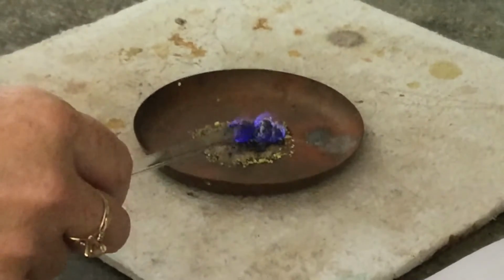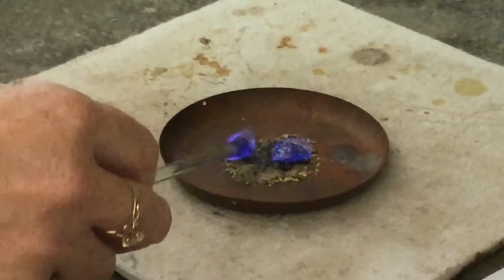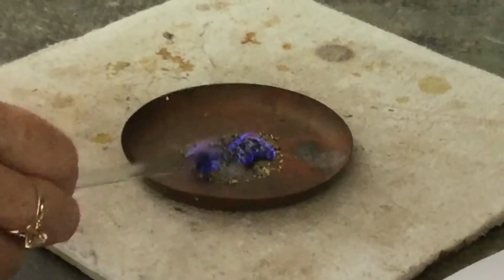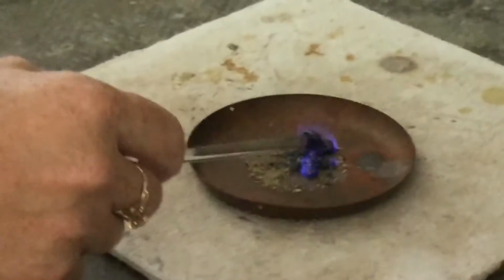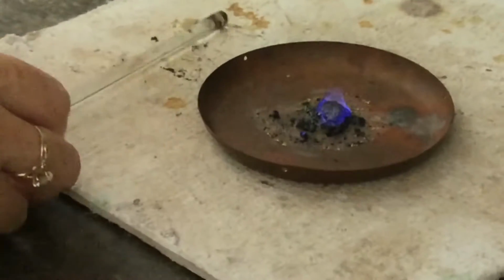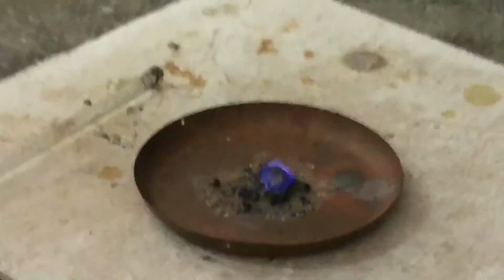Now this is what's called, we're going to learn about them later, an exothermic reaction. And so when the reaction starts to take place, heat energy is actually given out. Combustion or burning is an example of an exothermic reaction. What I've got underneath is asbestos, which is a fire retardant. It won't burn, and it will prevent the fire from spreading.